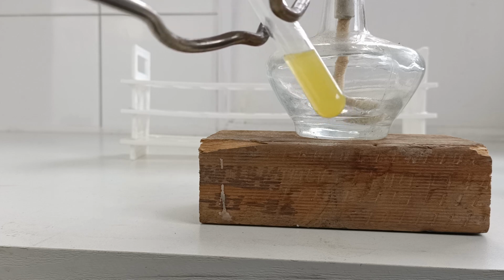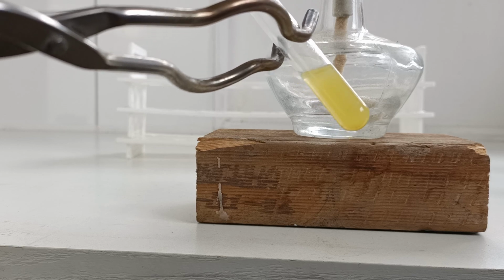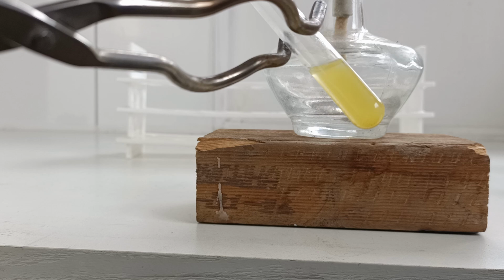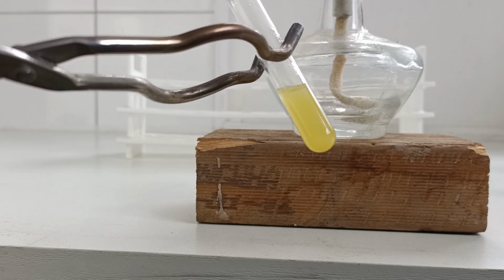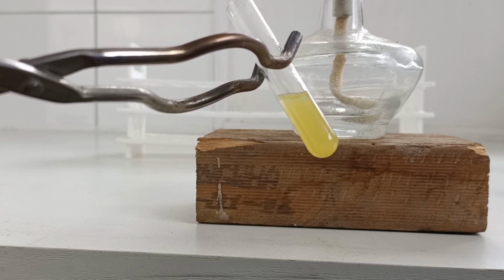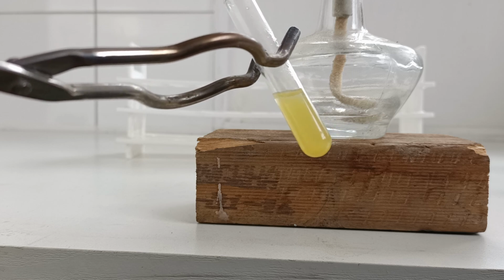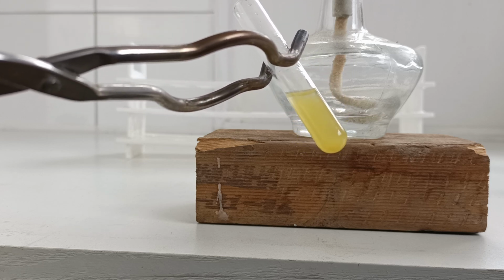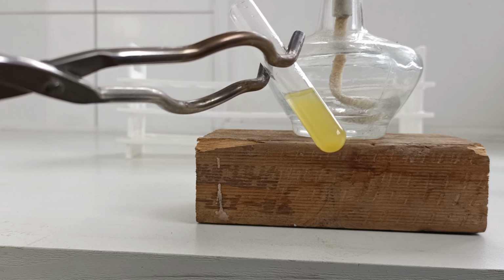There are a few other metal elements that will give you a bit of a precipitate, but it will not be yellow, it will be a white, cloudy sort of solution. So it's a pretty simple test. Arsenic can give you a bit of a yellow result, I believe, but it's not as positive as this. There's obviously only a relatively small amount of phosphate in that sample. If there was higher levels, you'd have a much brighter canary yellow.